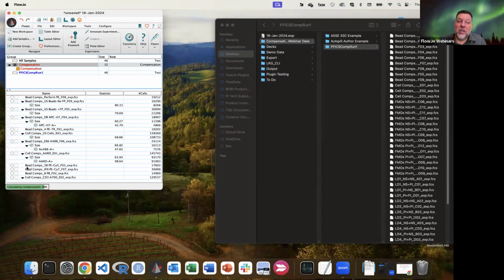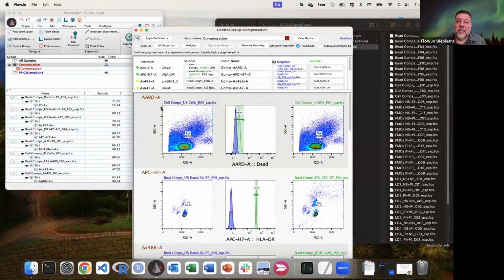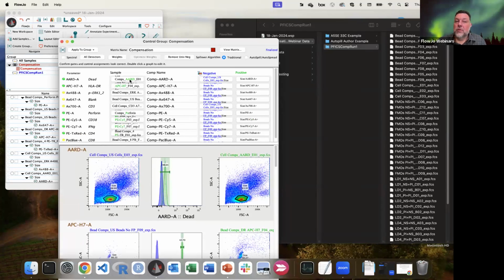After selecting the group, it auto-gates size, and FlowJo tries to stick each sample where it's brightest in each brightest channel, right? So it does a good job when there's a limited amount of channels, and the region of the spectrum is very discrete that we're looking at. It's harder on a spectral instrument. You have different gains and voltages for different sets of detectors, and things will go to the wrong detector because it's brightest in that one, even though it's not what you considered or designed the primary detector for.